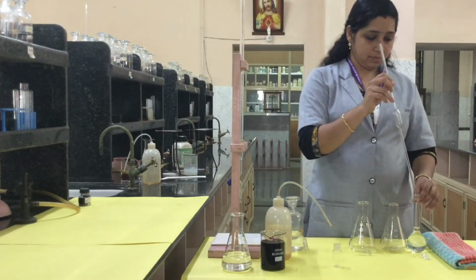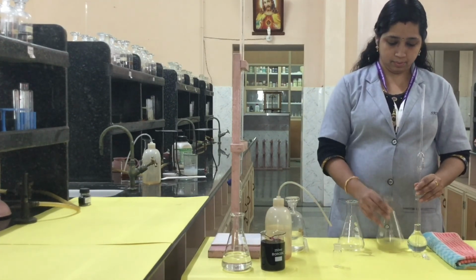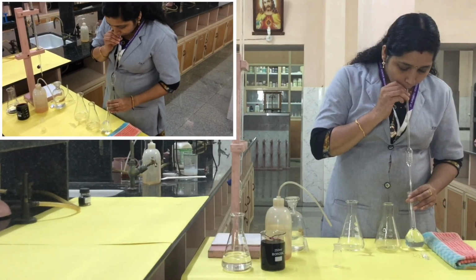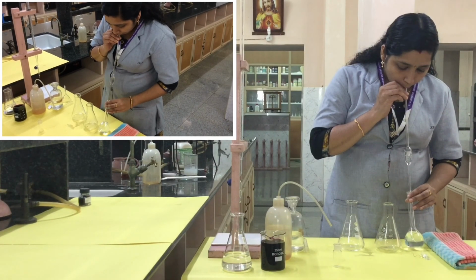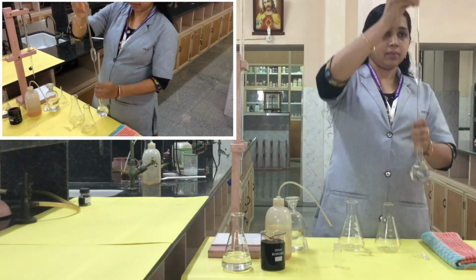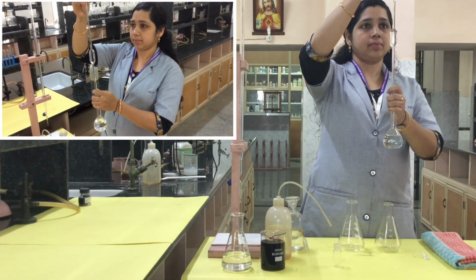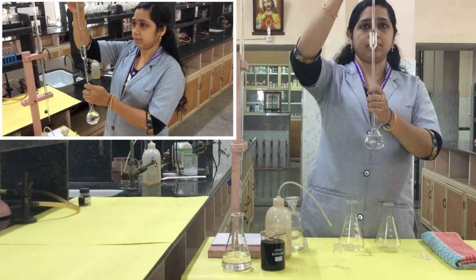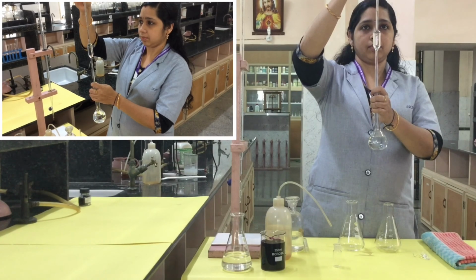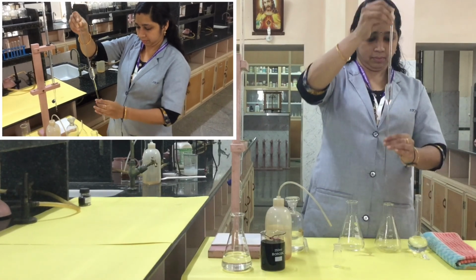Get ready with your conical flask near to the standard flask. Now pipette out 20 ml of the Mohr salt from the standard flask. You can see the line on this pipette that indicates 20 ml. So just pipette out 20 ml of Mohr salt, that is the standard solution. We just prepared the standard solution in the standard flask, so you have to pipette out 20 ml into the conical flask.